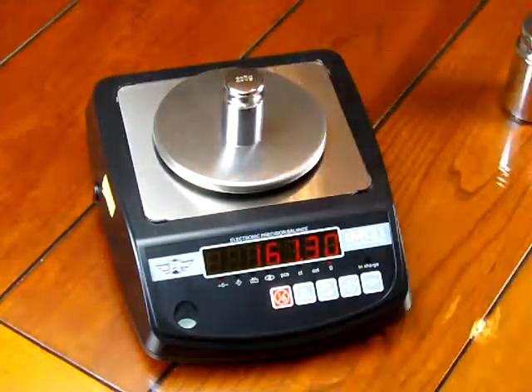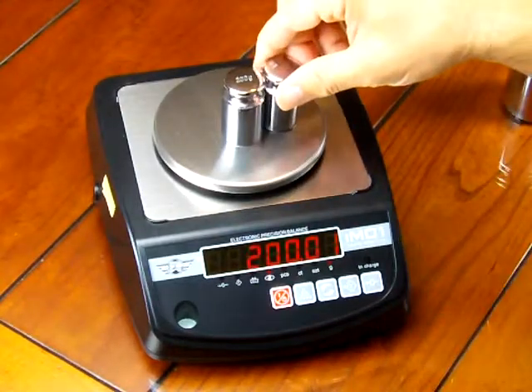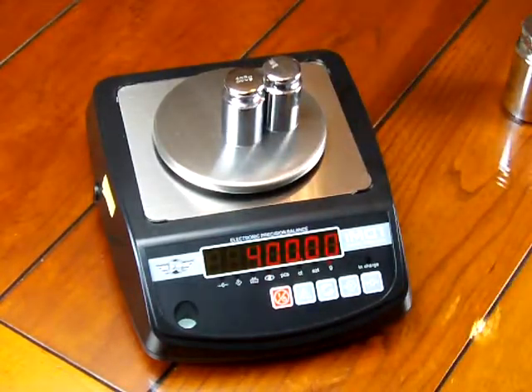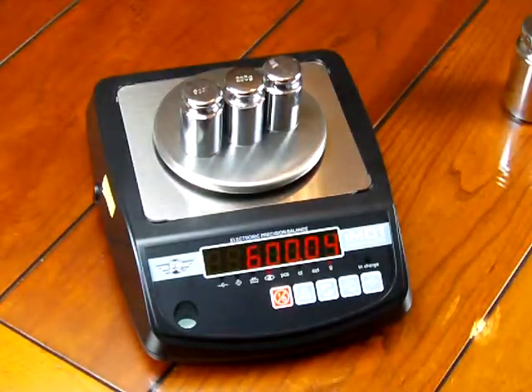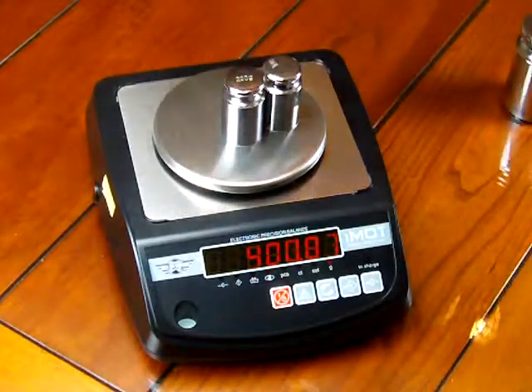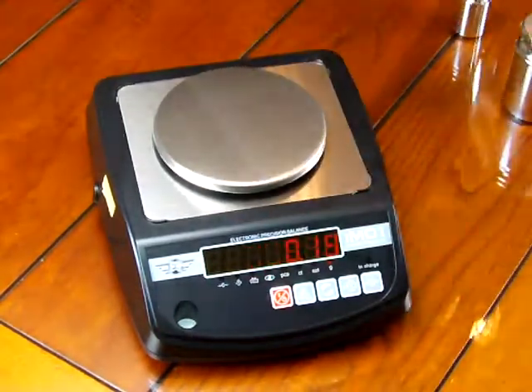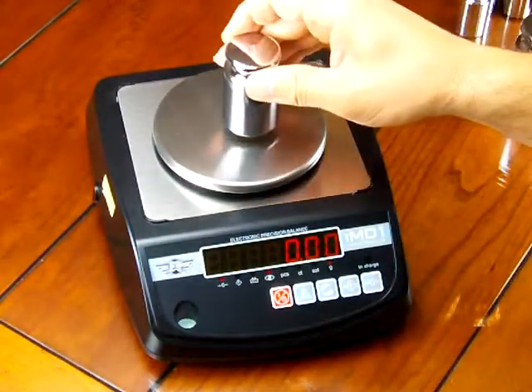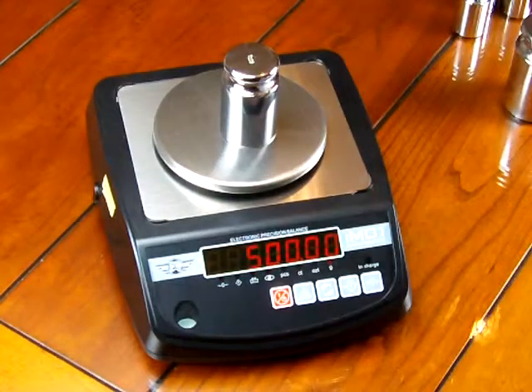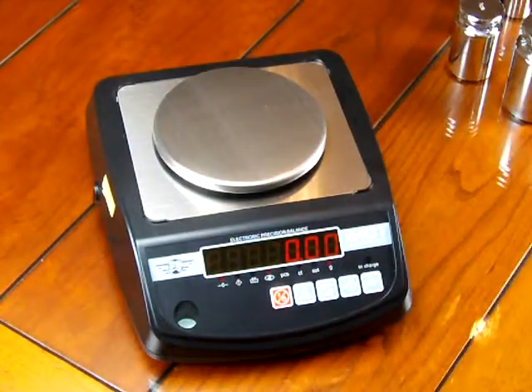We have a 200 gram weight here — these are ASTM class six weights, low cost and extremely affordable. If you wanted to calibrate the scale and you had 200 gram weights, you could put four 200 gram weights on. If you wanted to calibrate with two 500 gram weights, you can do that too. The key is you need 1,000 grams to calibrate the scale. So we've just demonstrated calibration.